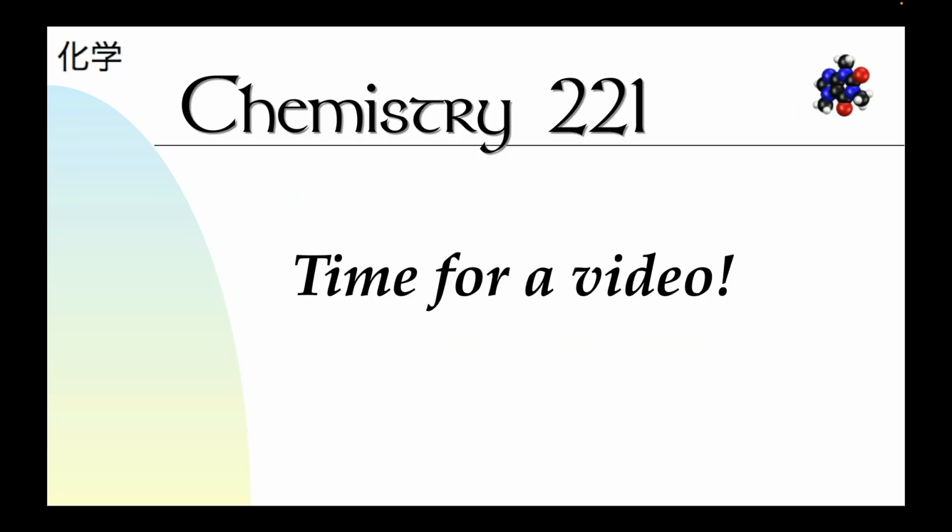So at this point, let's have a quick video that shows how this is going to work. Again, you're going to use patterns of reactivity to look for precipitates forming and stuff like that. Should be pretty chill. If you have questions on anything, let me know. I'm more than happy to help. There are no dumb questions ever in my class, so let me know. So without further ado, let's look at the video. Good luck with your lab.